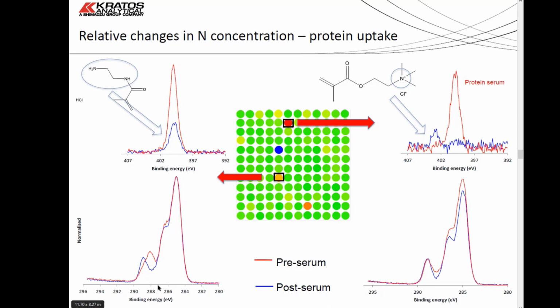at once, and being able to quickly see which ones have picked up and interacted with the protein and which ones hadn't. The nice thing is you can then also go back to each location and do more analysis if you want to. High throughput, high screening. You can see the data's a little bit noisy on some of these.